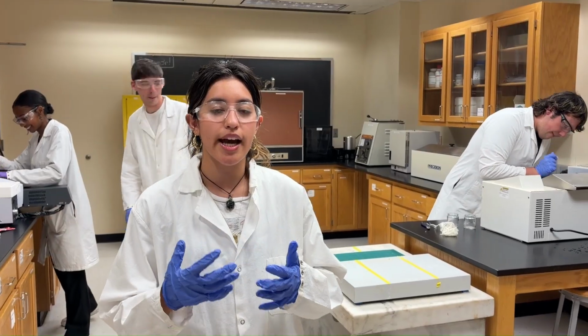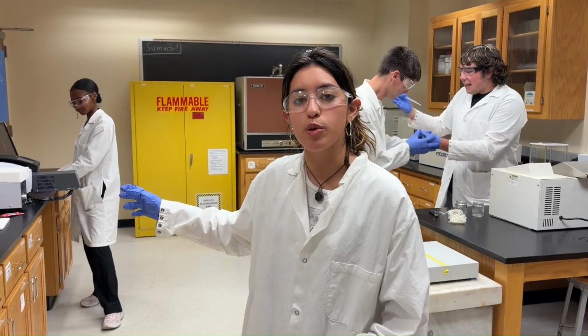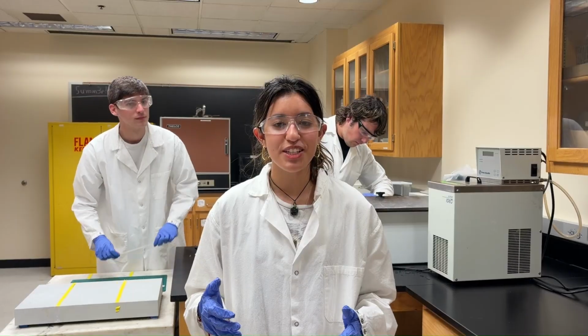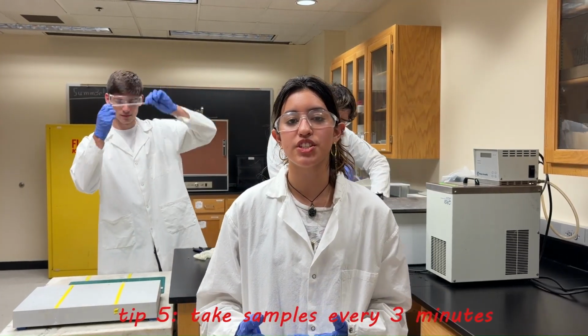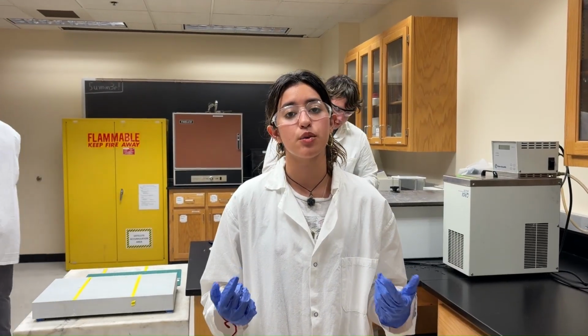What we did is we had a couple people working over here collecting samples, and then we had 2 people over here by the UV-Vis machine collecting those samples at the same time. We took samples every 3 minutes to see more of a change in the initial saturation. Because of this, you're going to want to work diligently and quickly.